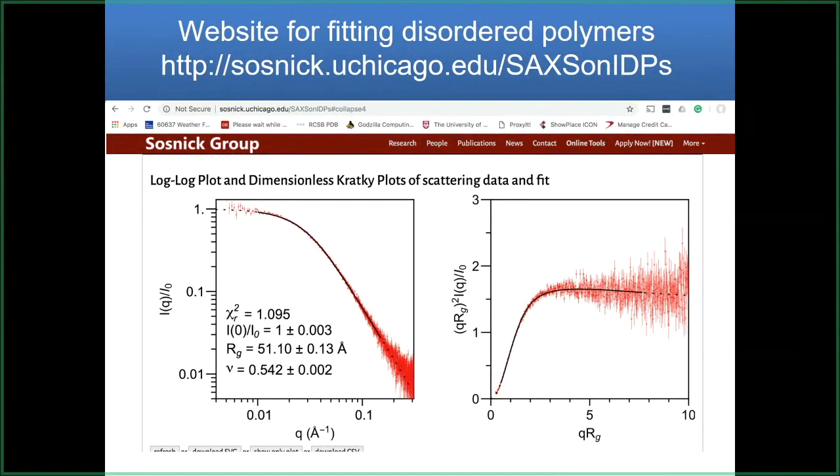Again, if everything works out nicely, we hope that the reduced chi-squared is near one. But do appreciate that if you only have, say, five data points, chi-squared can often be 0.7 or 1.3. Don't fall into thinking that it has to be near one. It depends upon the number of data points. If you have questions about that, I'm happy to show you some simulations we did on how often chi-squared should be close to one as a function of the number of data points you have.